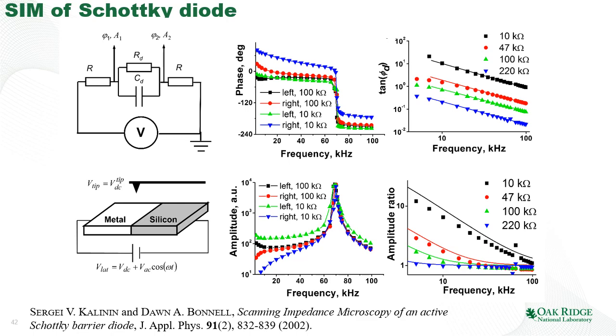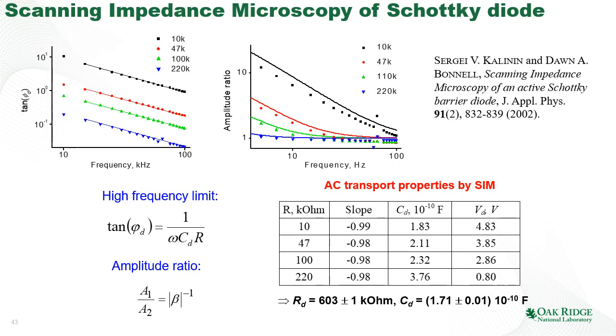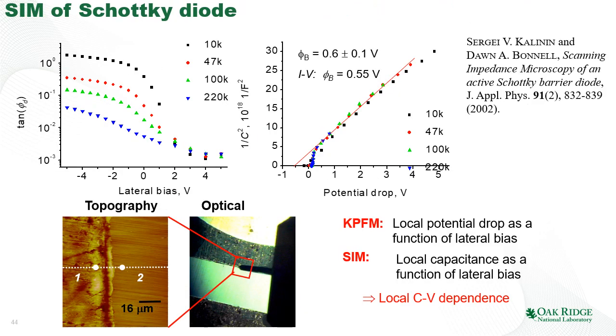the resonant frequency. I can take this data, fit it by the simple model, and extract the capacitance of the interface. I can extract the capacitance for different circuit termination resistance, and that means for different potential drops across the interface. If I combine these measurements together, I start to get the capacitance voltage curve for this individual interface, which I now measured locally. And as for the strontium titanate bicrystal, this capacitance voltage curve is measured locally, and it's independent of the circuit termination resistance, so it's universal.